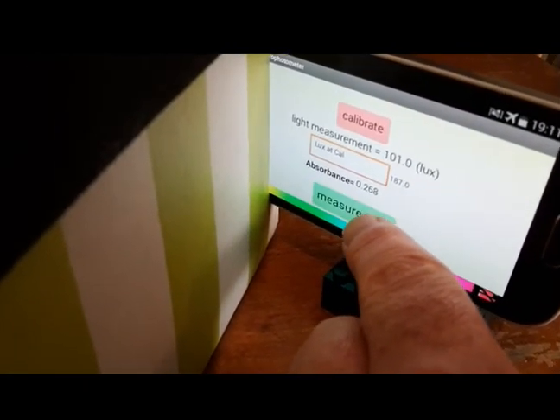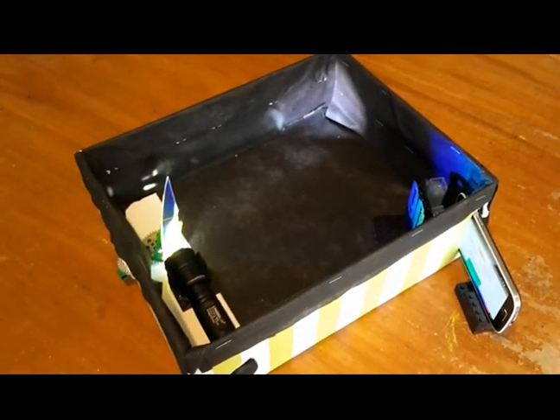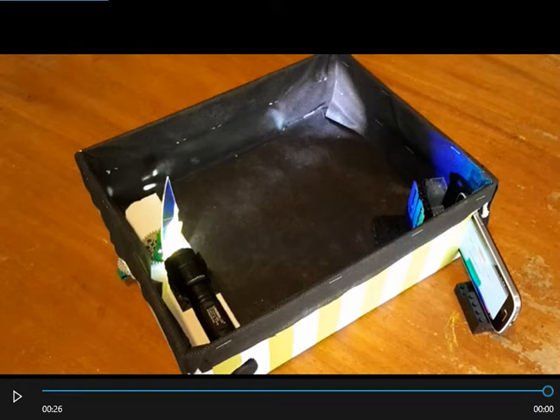You press measure absorbance on this app and it calculates the absorbance. This app is free on the Google Play Store. It's an Android thing and it's quite simple to make and would be a good part of another project to make your own app. I used MIT App Inventor. It's a block-based system, so it's dead simple to use because I'm not really a coder.